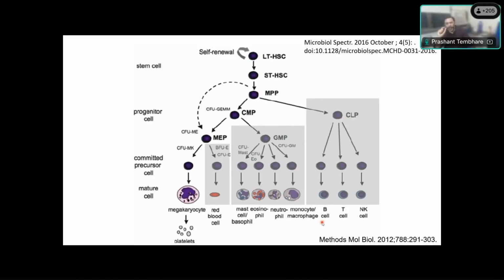the scatter. Now imagine a granule with such color that it absorbs the light. If a granule absorbs the light, it will not reflect, and since it doesn't reflect, there will not be scatter. Basophil or mast cell granules are metachromatic granules. They have the property to absorb the light. So they do not reflect the light, or even if the reflection is minimum, it will not give you higher scatter, and that is the reason there is low scatter in basophil or mast cell granules. Sometimes mast cells have complexity, so they may have slightly higher scatter as compared to the basophil.